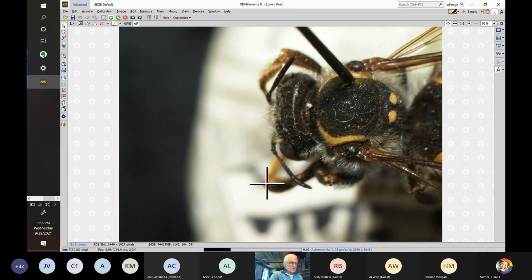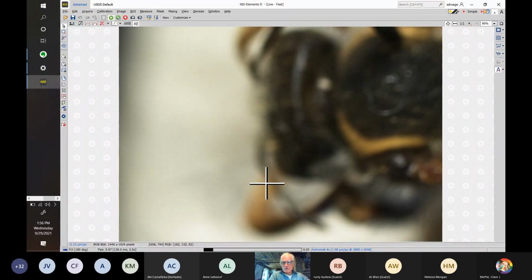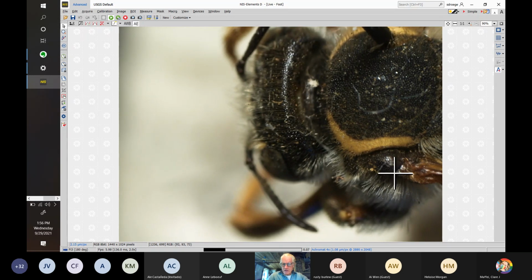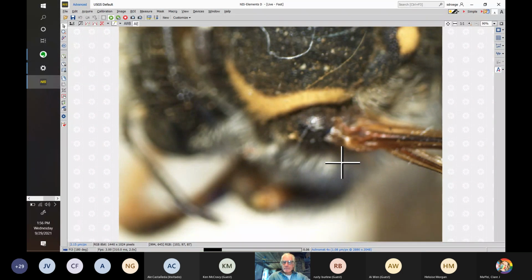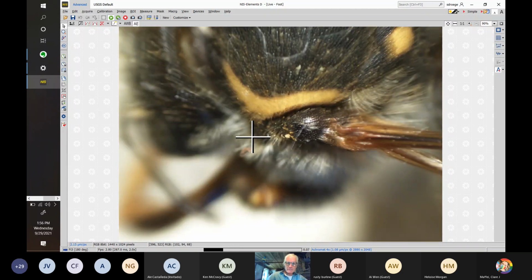Okay, so there's our back. Let's see if we can see the pronotal collar. So here's the scutum, here's the edge of the scutum. You can see the tegula here. Is that oval or not? It wasn't in the memorization chart, but I believe, yeah, that's pretty oval there, so very different from the D-shaped one. And this would be the pronotal collar area, and I can't see right now any particularly raised pronotal collar at the level of Dianthidium.